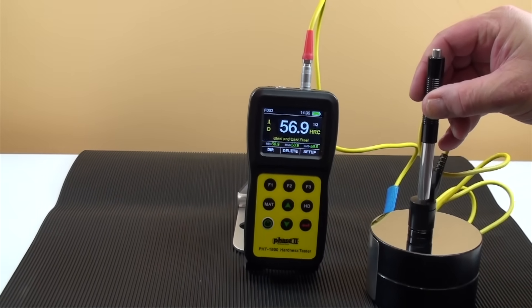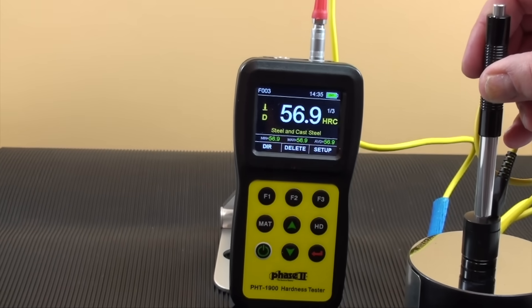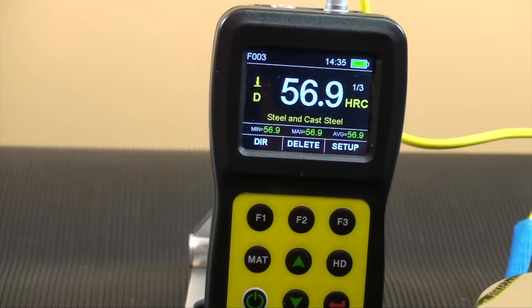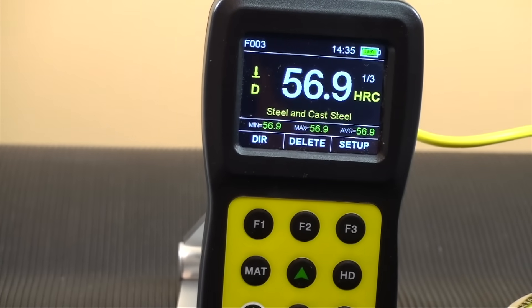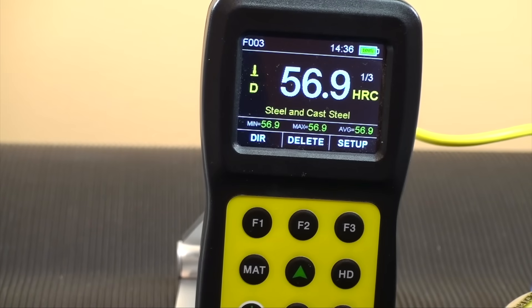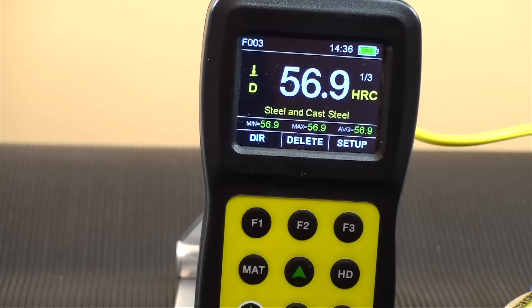You'll see the results on the screen. You will also notice that the screen is showing you battery life, direction of probe during the test, the type of impact device being used, the scale you are reading in, the material chosen, the number of tests you have taken, the minimum, the maximum, and the average.